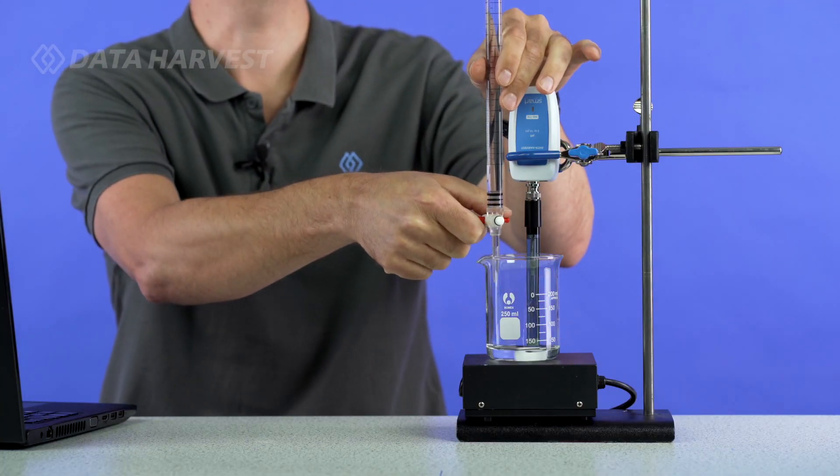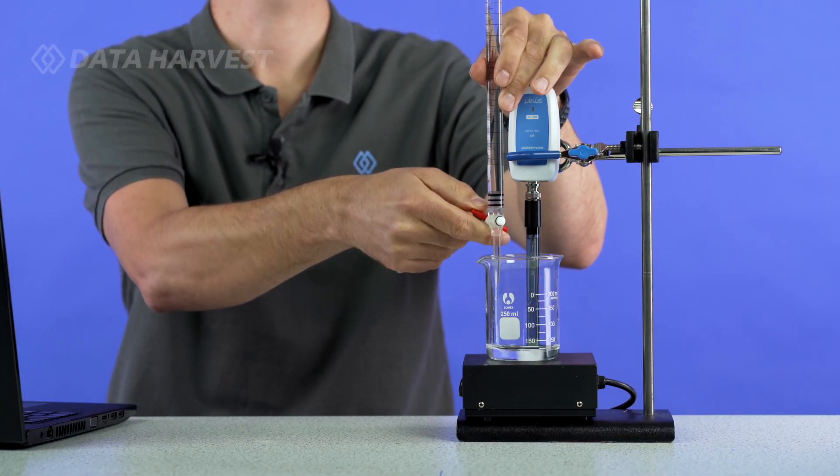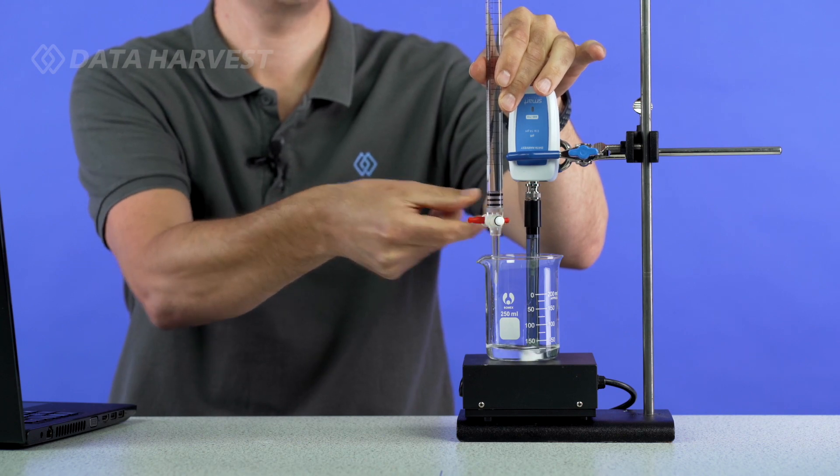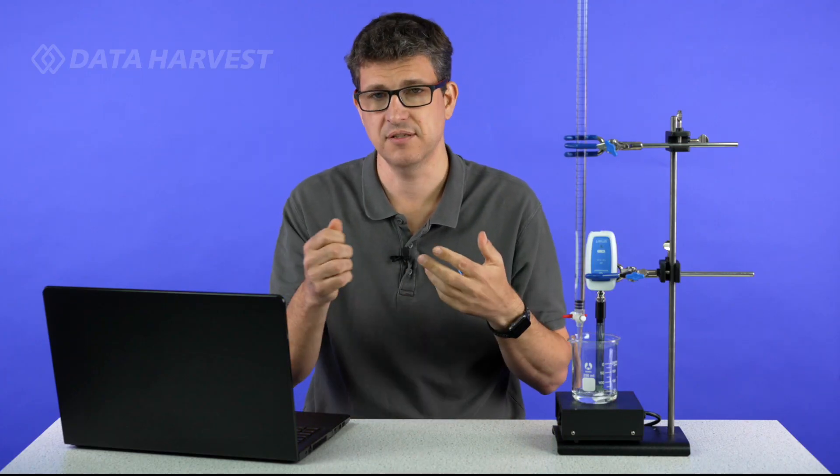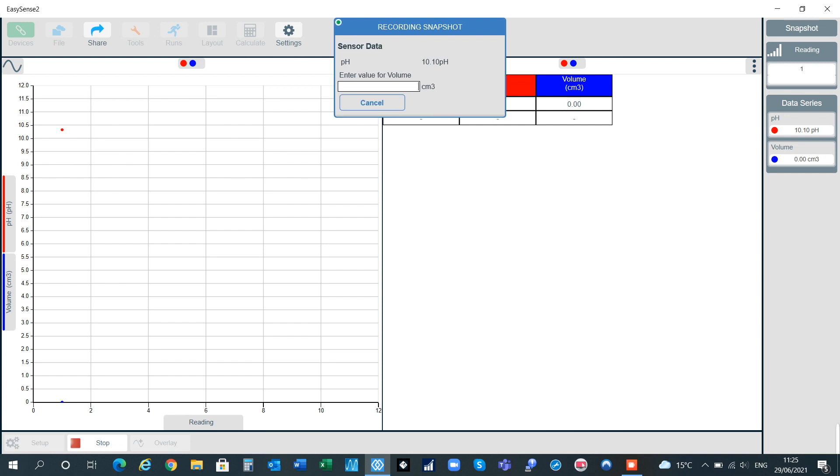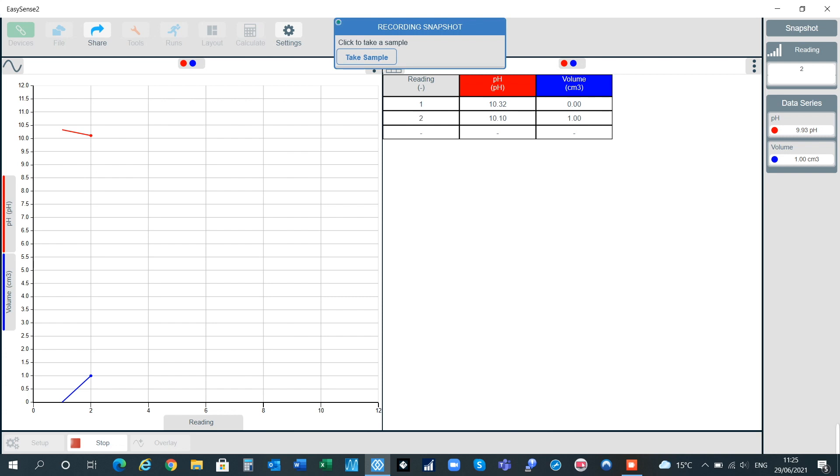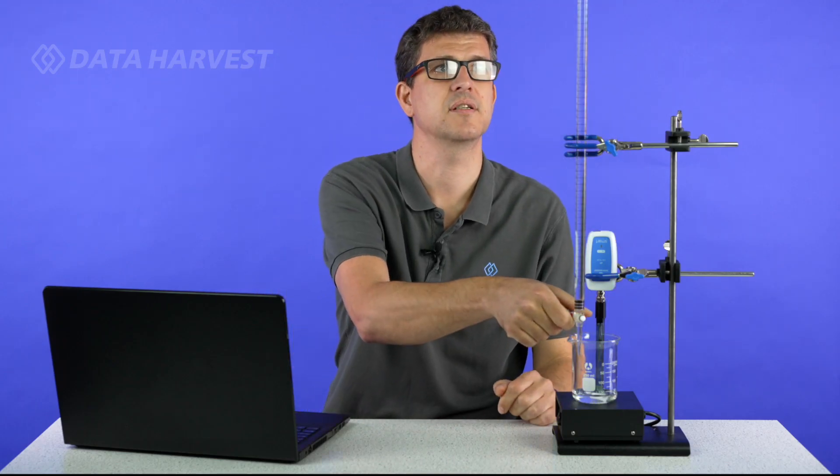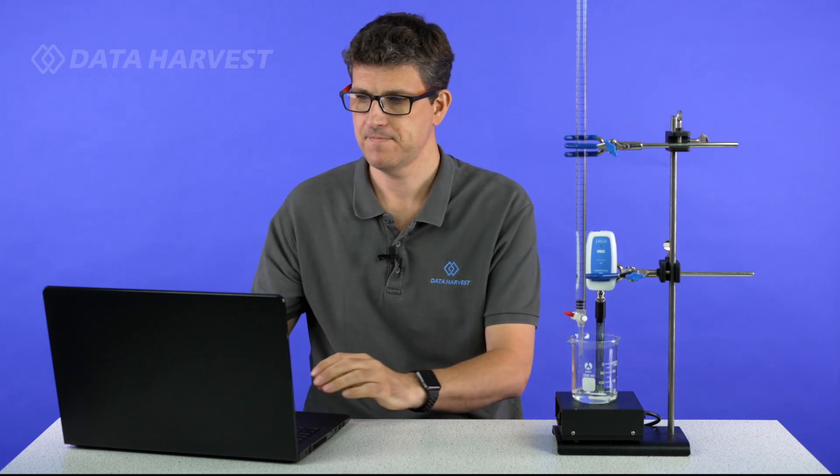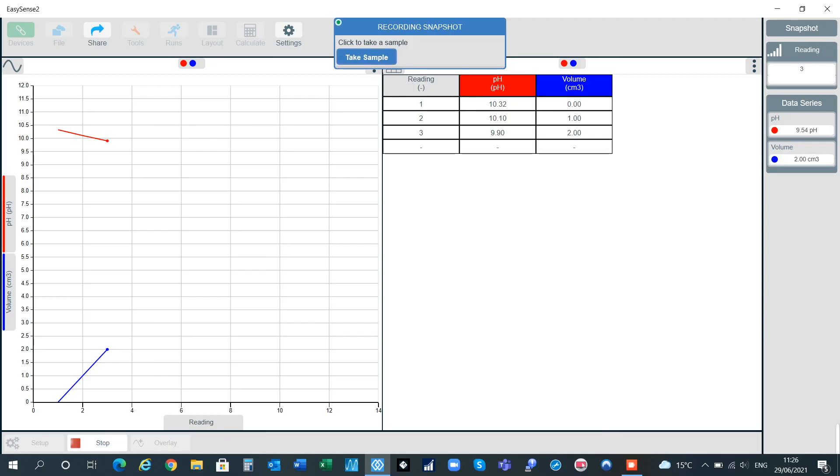I'm now going to let one mill through on here. A little bit more, there we go. Let that mix. We have magnetic stirrer here, you can also use a glass rod and mix it that way as well. We just let that settle and I shall now take another reading and we're now that's going to change to one and we save that sample. I'm now just going to repeat this 50 times, well 49 more times. Let it mix for a moment, take a reading and now that's going to be two. And remember if you forget where you were you can always see the number up there so the students can type that in very easily as well.